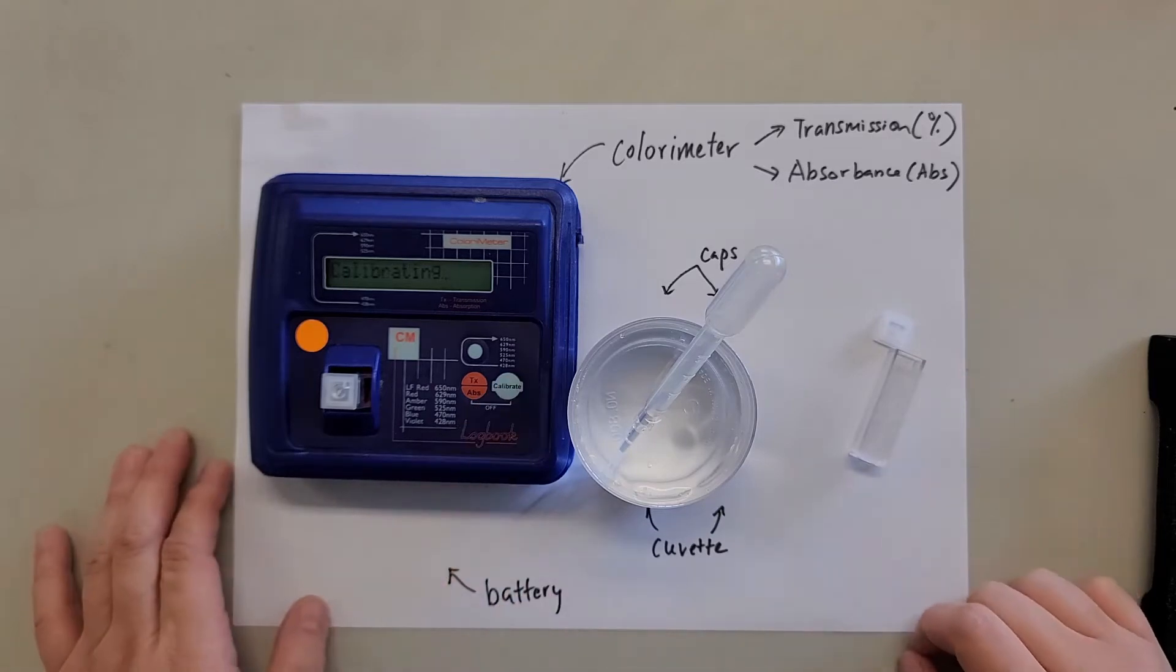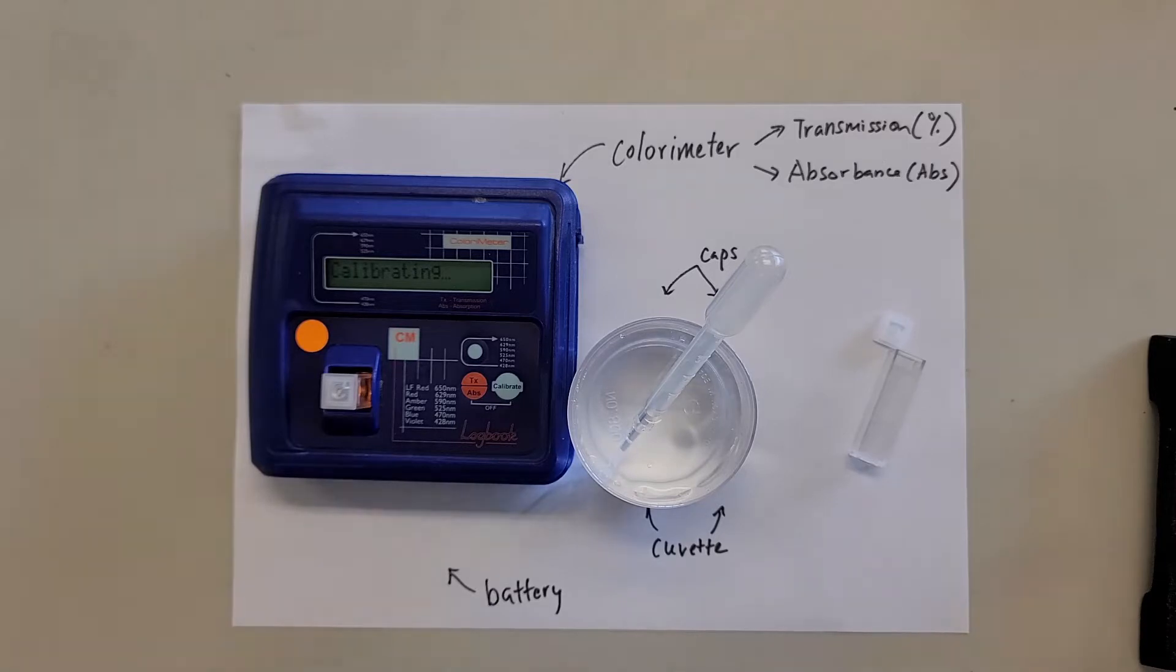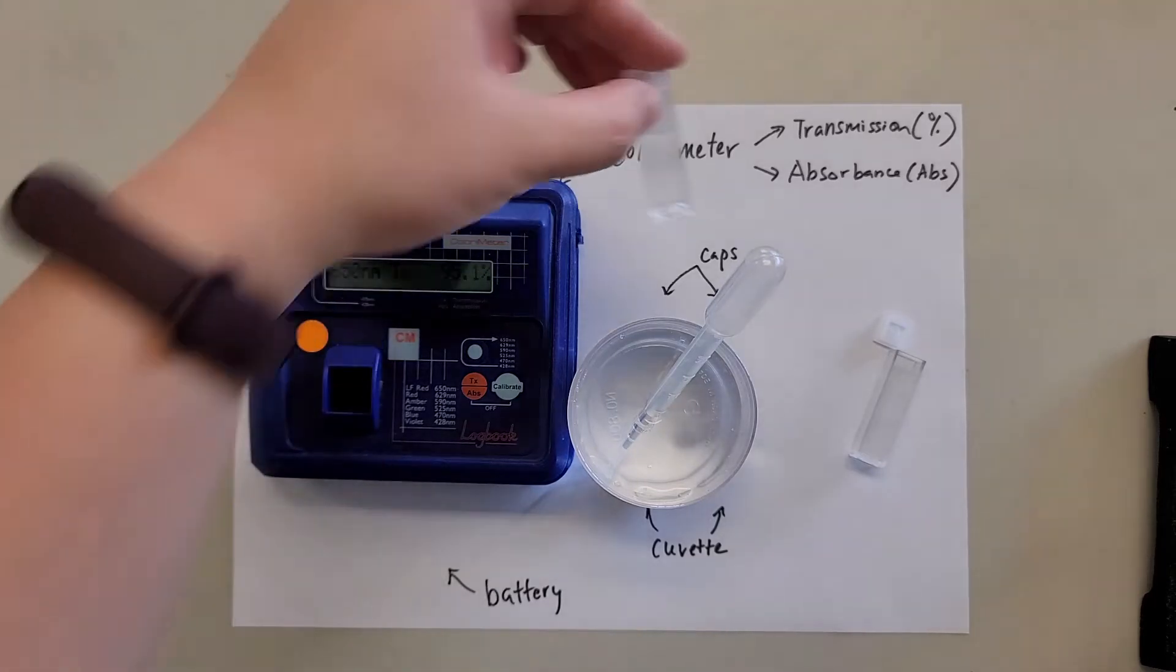And then press calibrate. So once it's calibrated, you can see that it's in transmittance 100. So that means all the light can pass through the distilled water. That's the calibration.